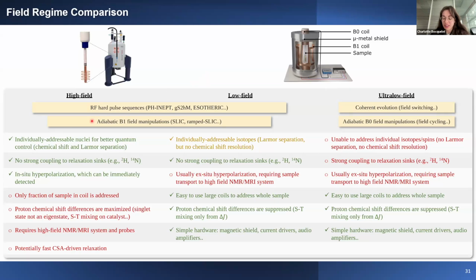I had a very naive question about the magnetometers you're using. So it's at zero field, Earth magnetic field, and I guess you cannot put this in between two 1 Tesla permanent magnets, right? Or 0.3. The magnetometers. Yes. Yeah, no, they will saturate.